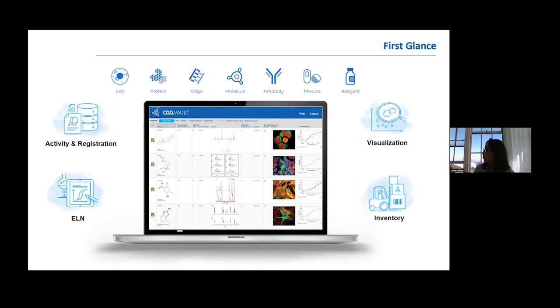If you look at first glance, the Vault consists of four modules. We call it activity registration, visualization, inventory, and ELN, and of course API, which I will cover later.